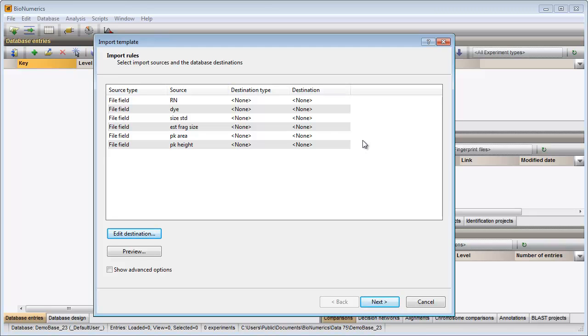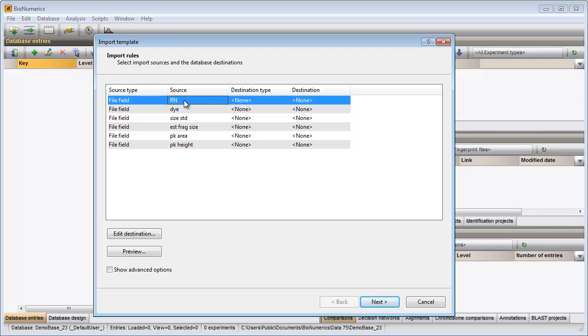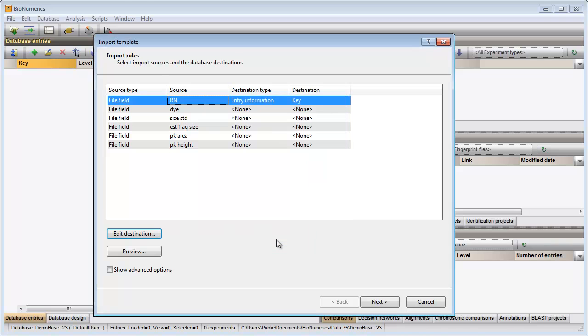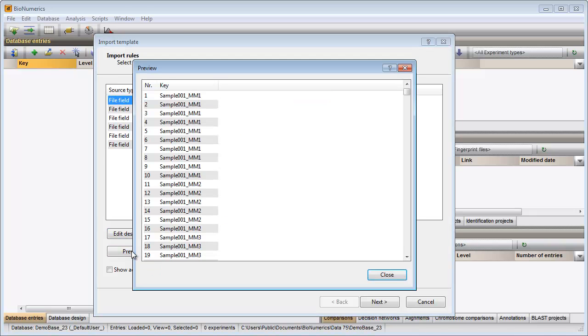Since the first column contains the sample names, I will link this information to the key field. If I now press the preview button, I can check the rule that I have defined so far. From the preview I can see that not the complete file name should be linked to the key field, but only the part that appears before the first underscore.